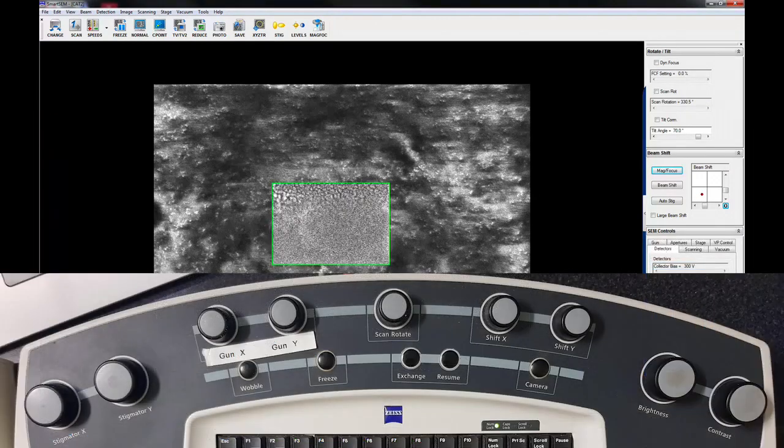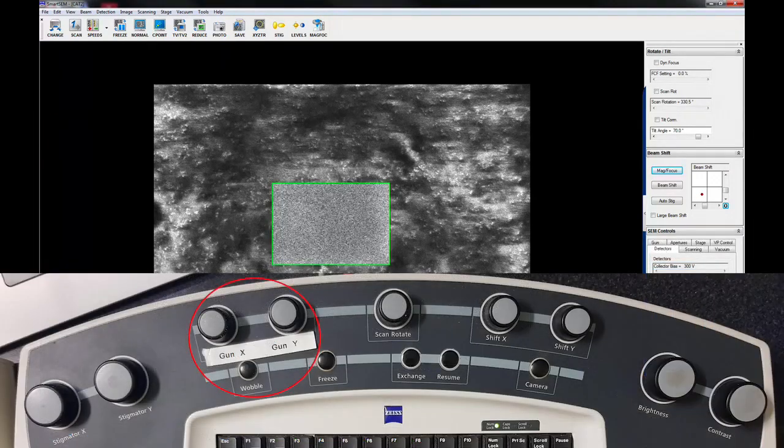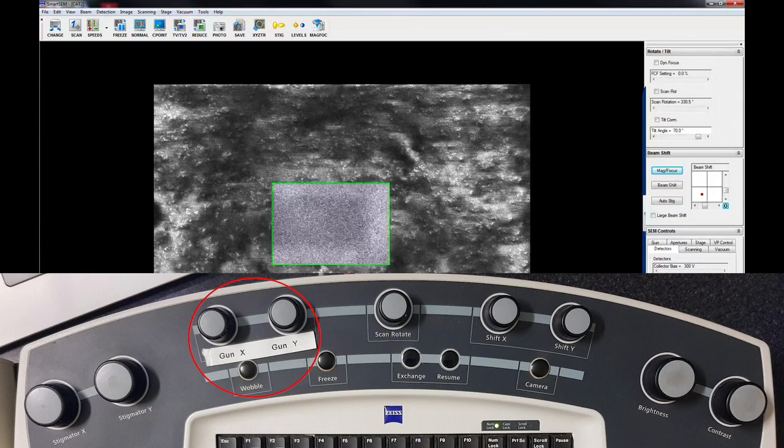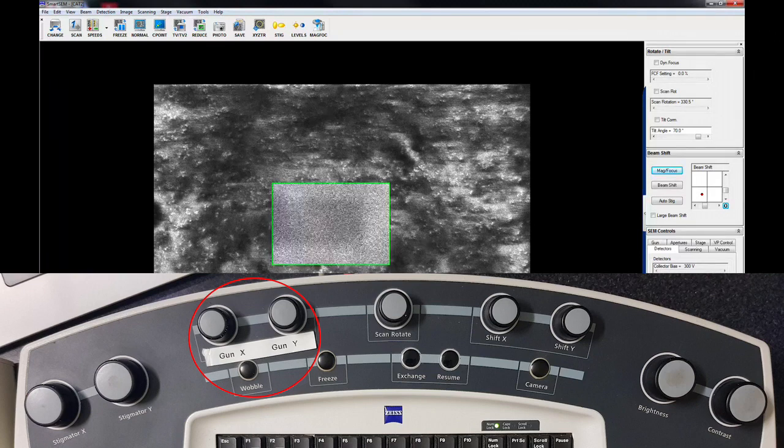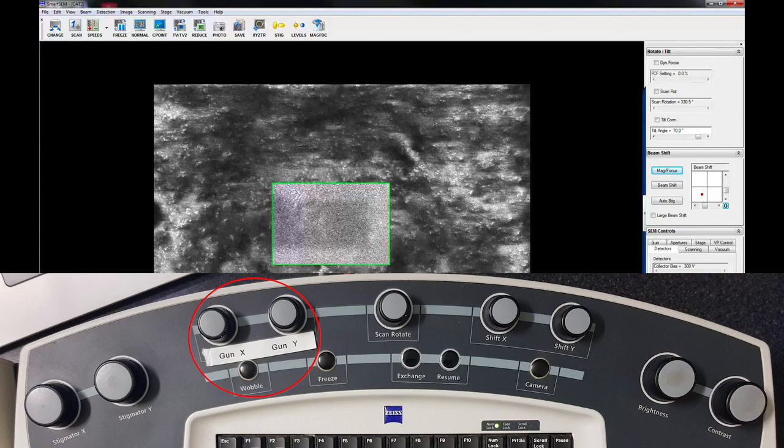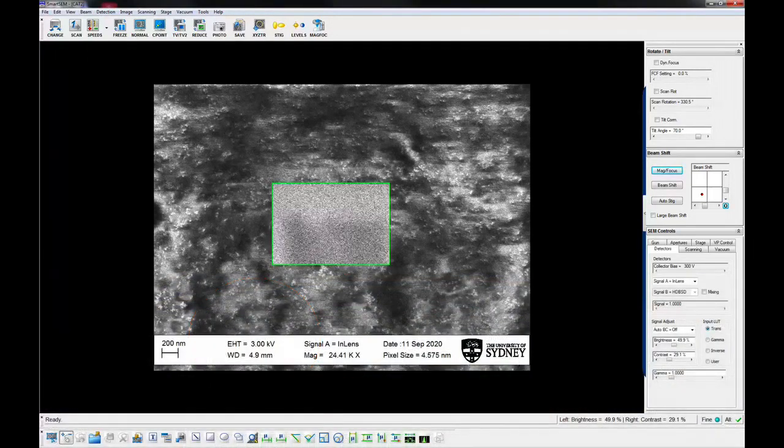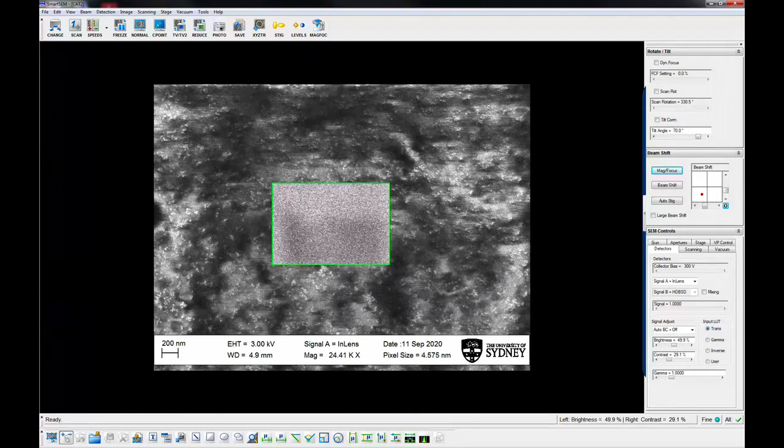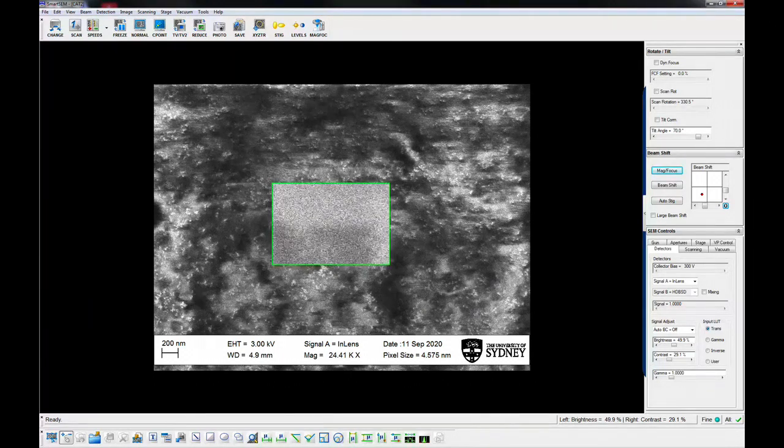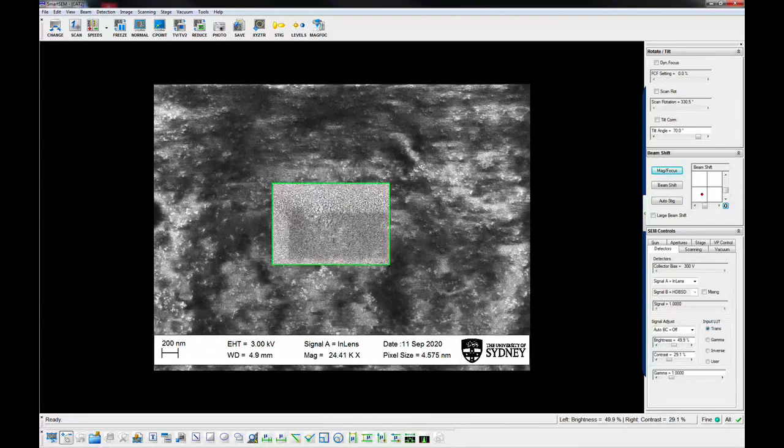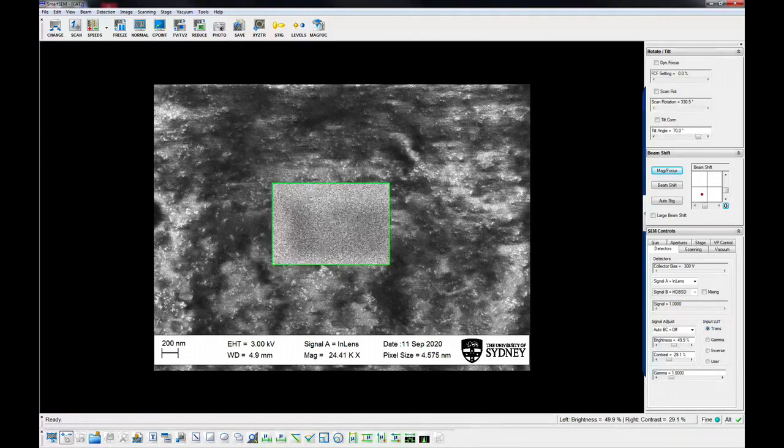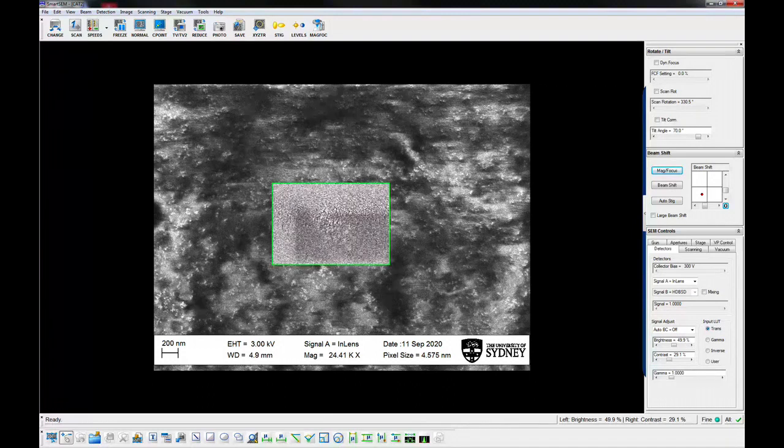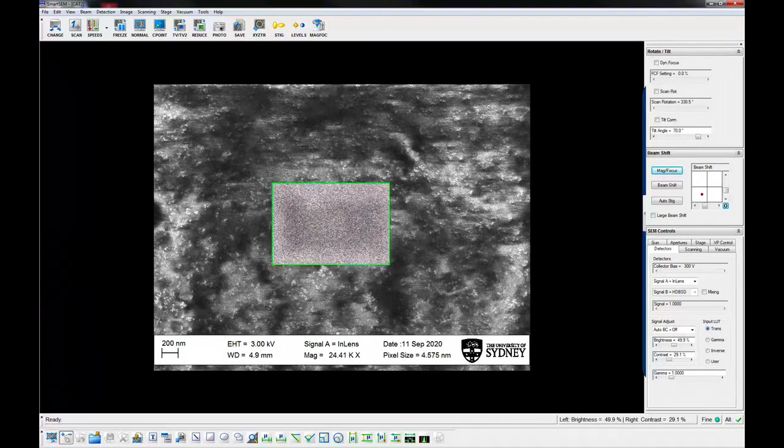Press the wobble button. Centre the apertures using the X and Y controls to minimize the movement of the image as the focus wobbles. The aperture must be re-centred whenever a different aperture size is selected, when changing to or from high current mode, or when making substantial changes to beam energy. Turn off the wobbler.